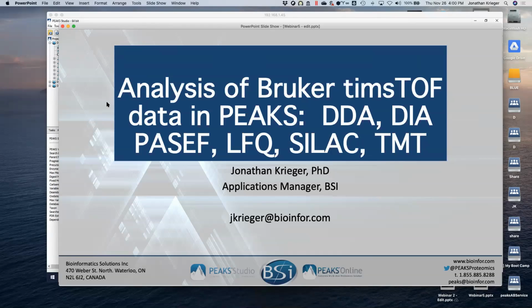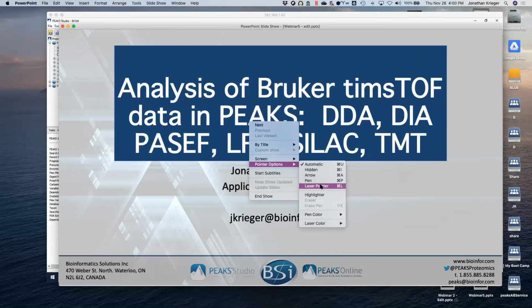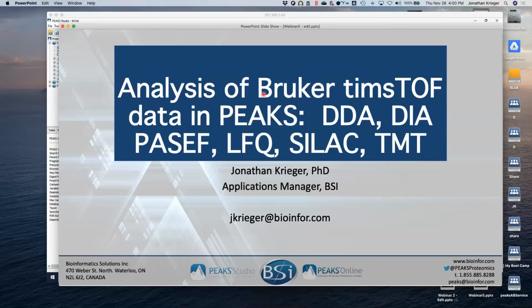And so really what we want to do with this webinar is show you how one can analyze Bruker timsTOF data using the fourth dimension that Bruker provides, for both DDA, DIA, PASEF, label-free quantification, TMT, and if we get a chance, I may be able to show some SILAC data, depending on how far we get. Let me go to the next slide.